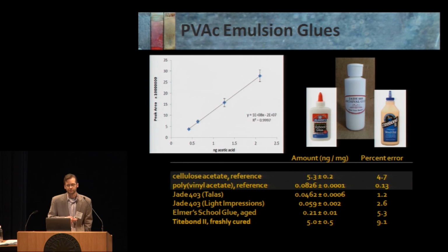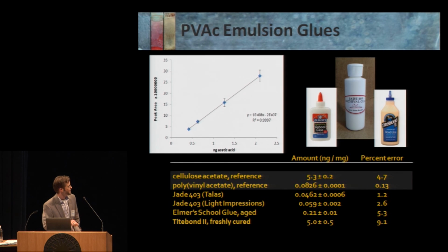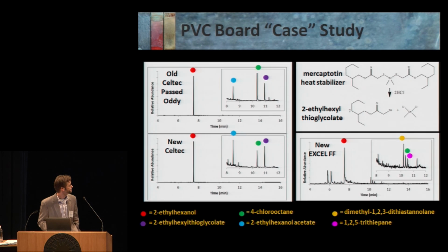We also ran household white glues as well as shop glues. And when you look at these numbers, they pan out about the way that you would expect. The Jades, which are considered the archival quality PVAs, emit far less acetic acid than the household glues or the wood shop glues. And when you look at our percent errors, they're quite low, again, because these are very well-behaved samples. So if you're going to select a material to use, Jade isn't so bad. And this matches up with what Jane Down from CCI recently published in Studies in Conservation.